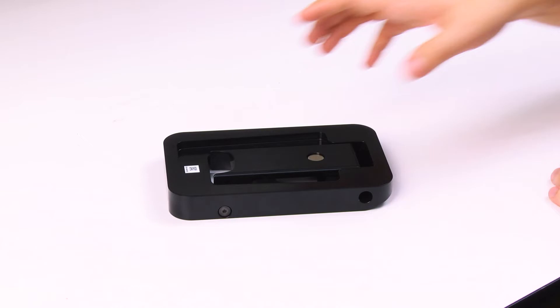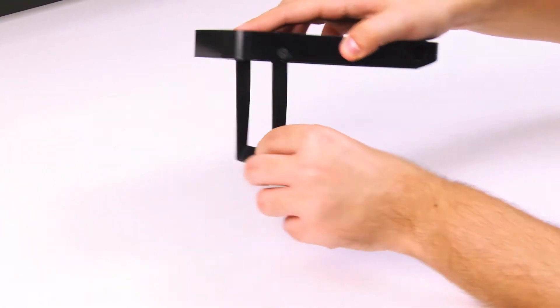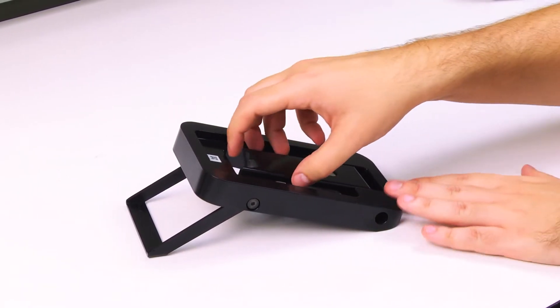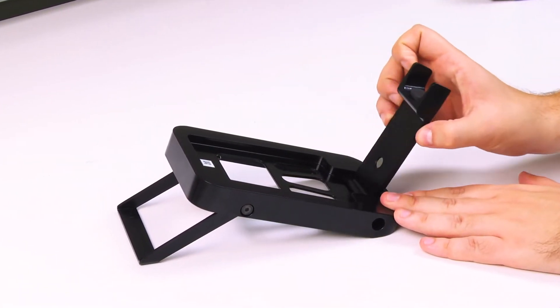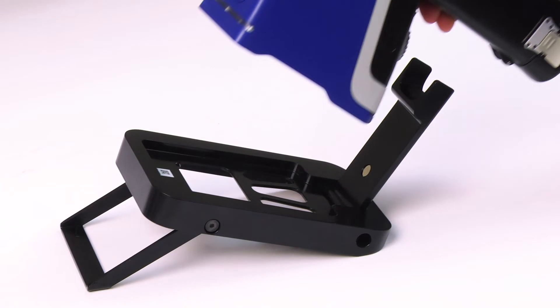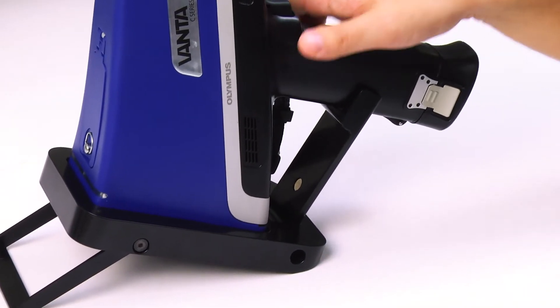To set up the field stand, pull the foot support out from the bottom of the base and place the stand on a flat surface. Then pull up the Vanta support. This support has a replaceable pad in place to ensure proper handle support for the Vanta. Place the Vanta into the stand, resting the handle in the support.